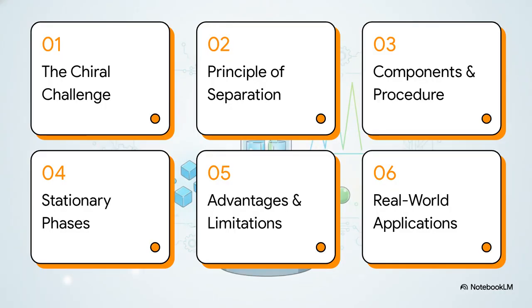Here is our roadmap for today's masterclass. We'll start with the chiral challenge, then look at the principle of separation, our system components and procedure, the chiral stationary phases, advantages and limitations, and wrap up with real-world applications. Let's get to it. Section 1.